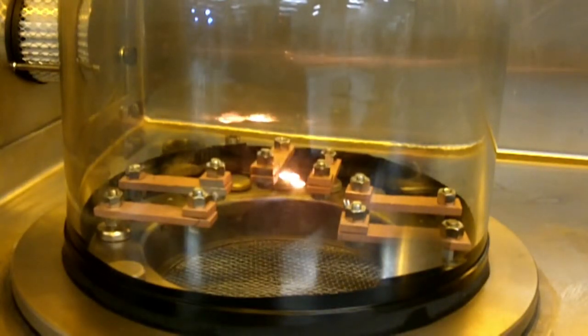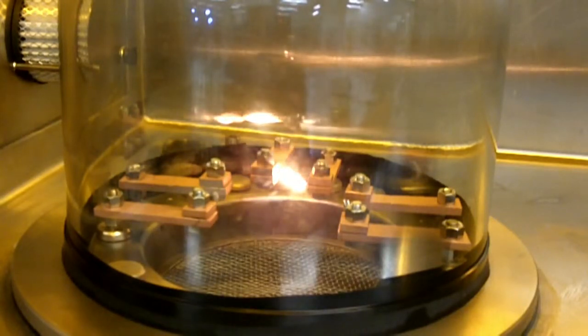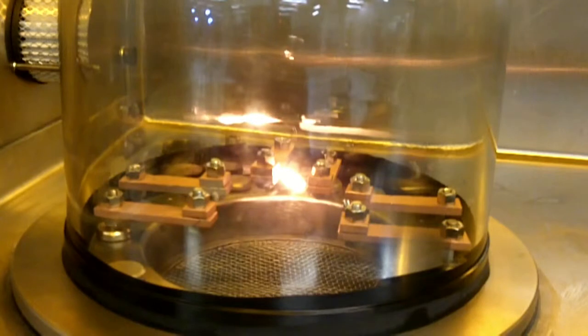You may have noticed that the light went dark for a moment — the aluminum melted and dropped into the cup, and so it cools the filament. The aluminum is melting and evaporating.